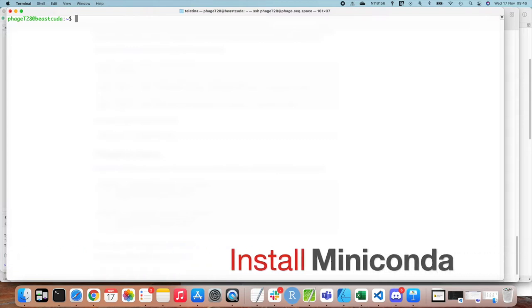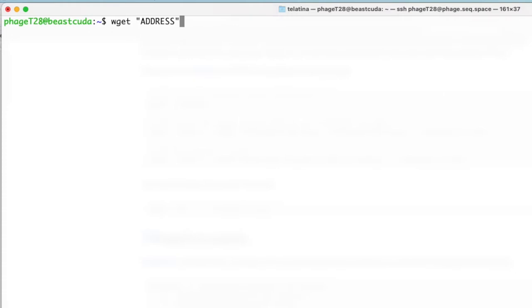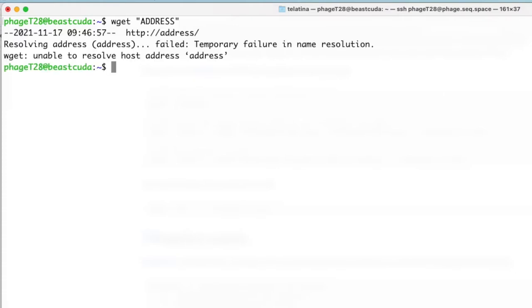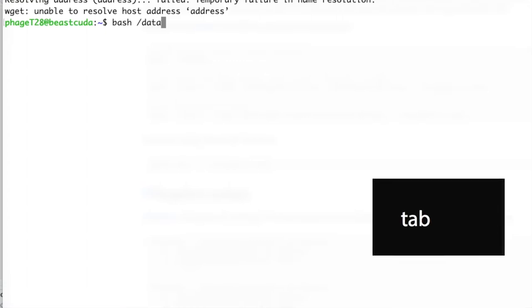The first step is to install Miniconda. That's usually the first step anywhere you log in because Miniconda can run in your user space, meaning you will not need to be an administrator of the server. It's the best way to have updated packages from both bioinformatics and general-purpose repositories. Usually you will need to download an installer from the internet with wget and then the address of the repository.